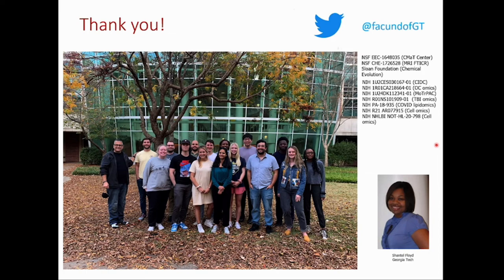I didn't talk about it today, but we're trying to do single cell metabolomics. That is a little bit sci-fi right now, but I think that in 5-10 years it's going to become routine. It requires very specific technology, but we basically do it on all types of samples. Some of our favorite samples are urine, because it's a little bit cleaner than serum. We started working with you on the pap smears, which is not something that we've done before, so it was really interesting. We had a long discussion internally on all the things that we could do with that type of sample.